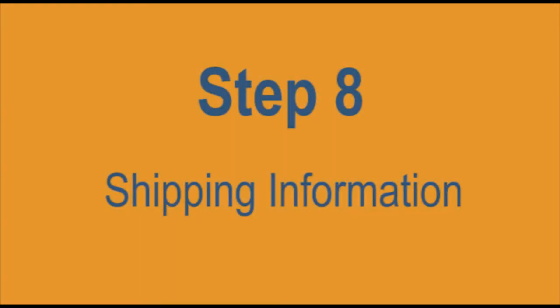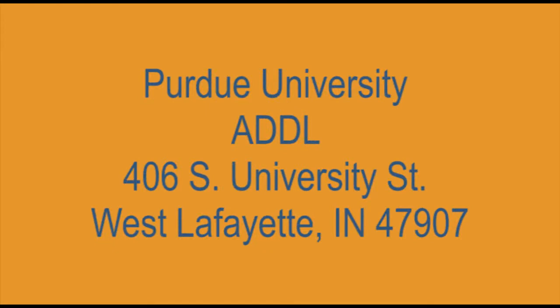Step 8, Shipping information. The shipping address that the samples get sent to is the Animal Disease Diagnostic Lab. You can abbreviate it ADDL, 406 South University Street, West Lafayette, Indiana, 47907. And the samples should be shipped to the laboratory within 7 days of death.